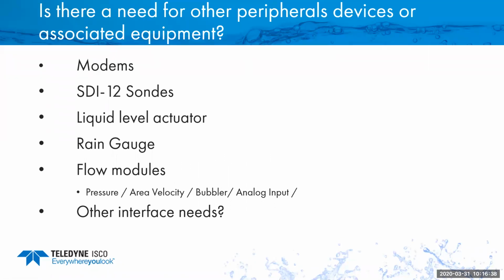Is there a need for any other peripheral devices or associated equipment, anything that's going to interact with the sampler, to tell it when to start, when to stop sampling like that?